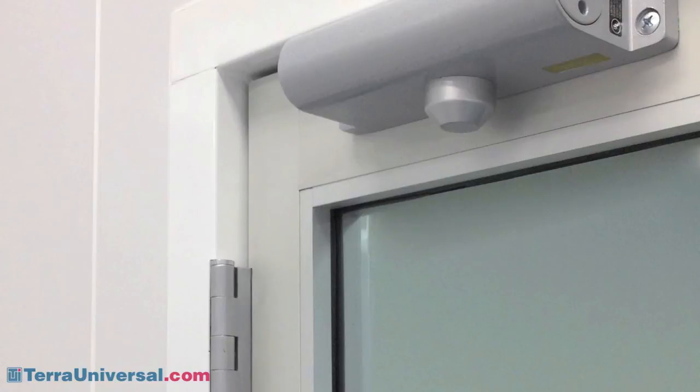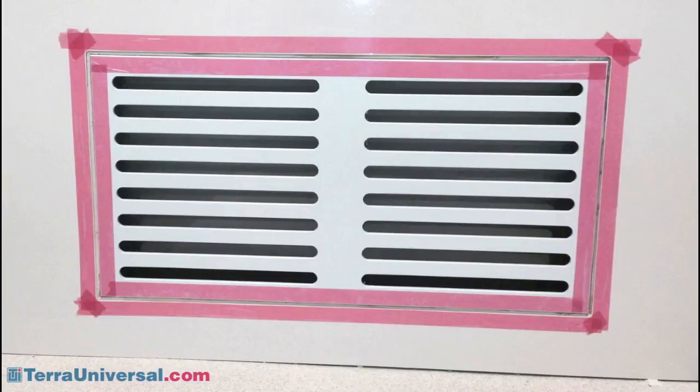Apply seam sealant to any additional cracks in doors, windows, or other seams inside the room. Silicon caulking can be used around sealing panels if required.